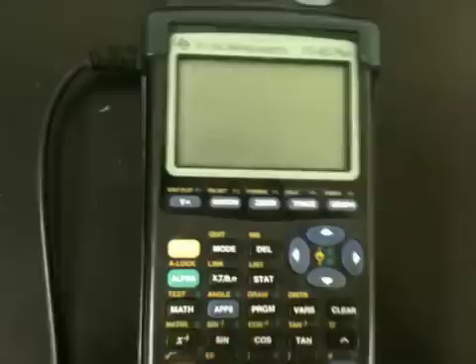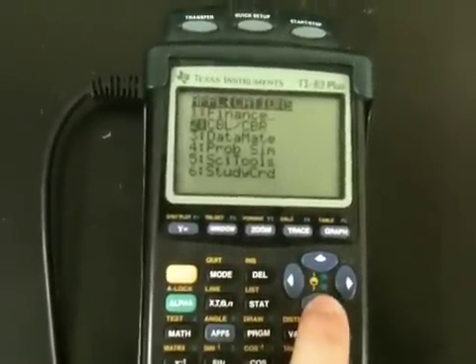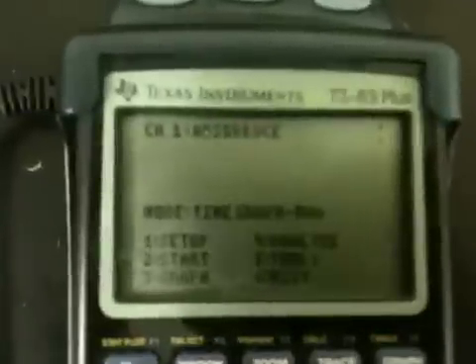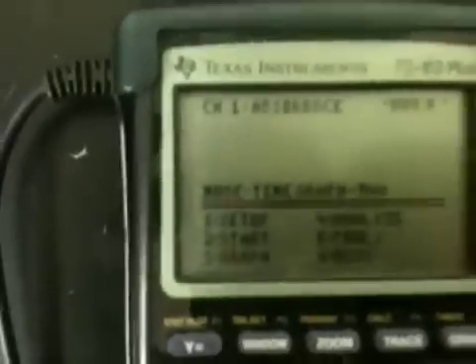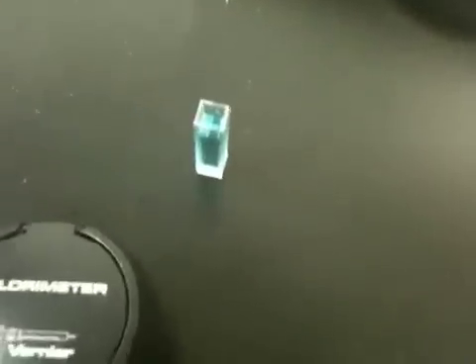Then we're going to turn on the calculator, and then click where it says Apps — this button right here. Then we're going to go down to where it says Datamate. You click Enter, and then it loads Datamate and the software. You'll see it says an absorbance reading. You really need to make sure that the absorbance reading is zero, because we want to make sure that the water is not absorbing light, since we're going to try and measure this blue solution over here.